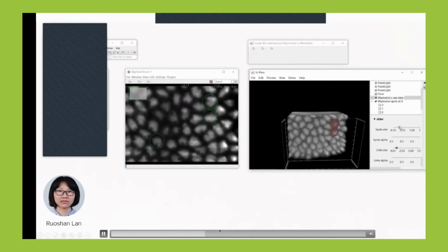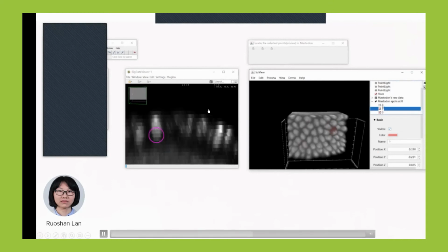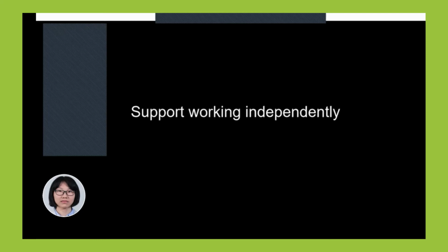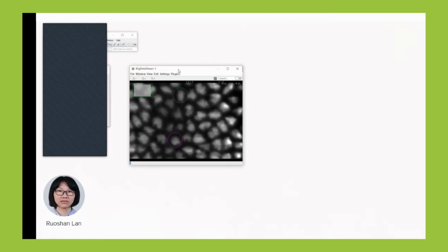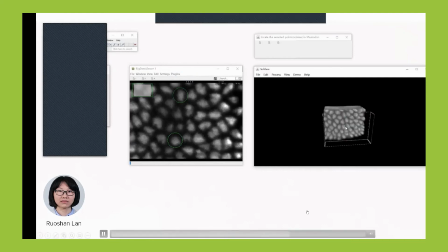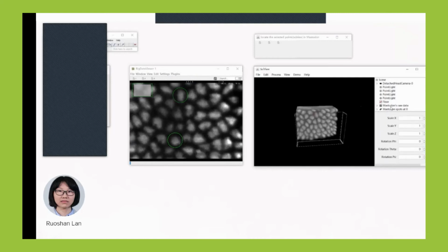I will skip ahead here a bit. We can change the spot size. So this is actually going pretty well, and you don't need to have several views of the same data anymore. You can actually put on your VR headset. You can see what the cells are doing within their natural environment, so to speak. And the next step is to put the bionic tracking approach on top of that. So we can actually use that directly inside Mastodon and put that into people's hands.